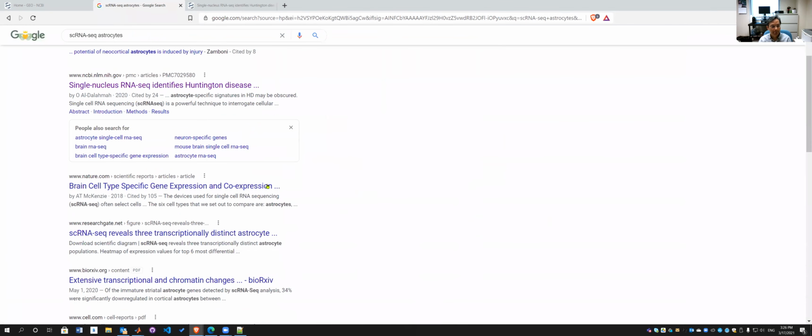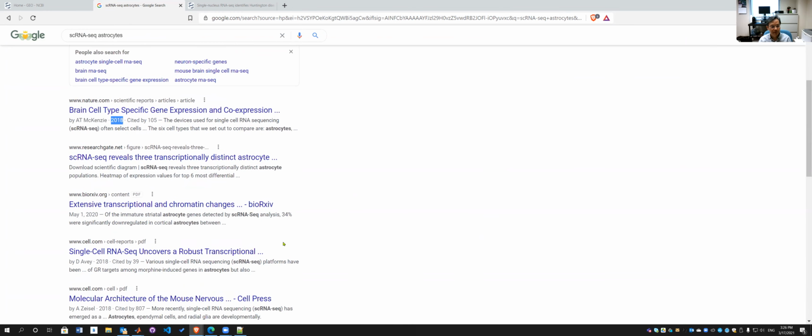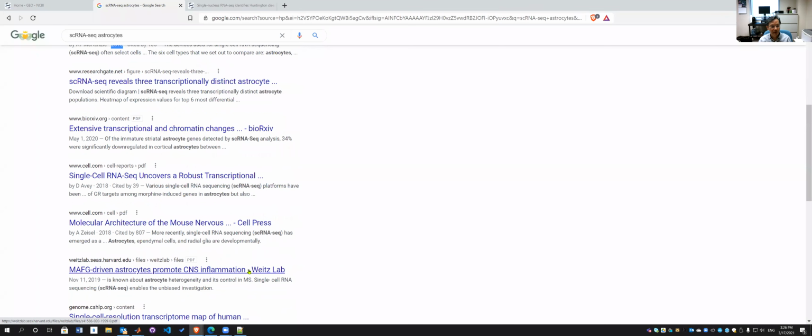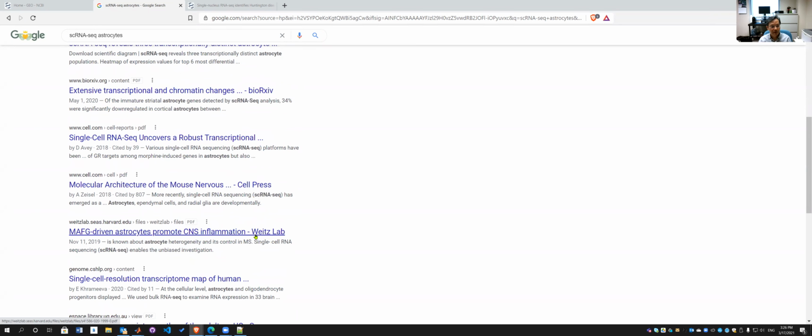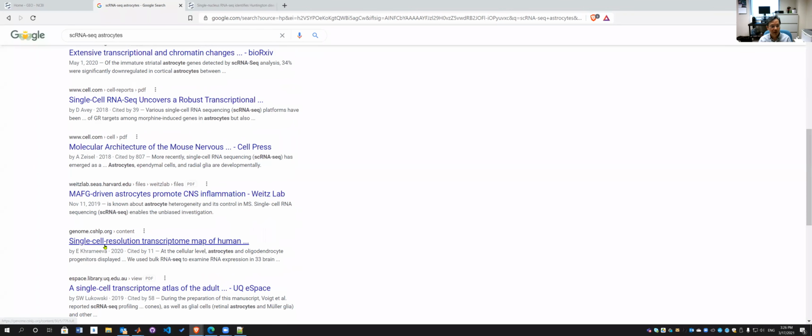Unsuccessfully. Another paper is published too early, so I don't want to use it. Okay, this is relatively... results human map.